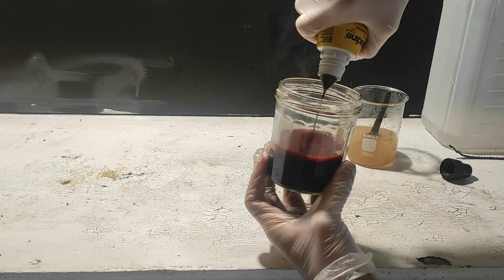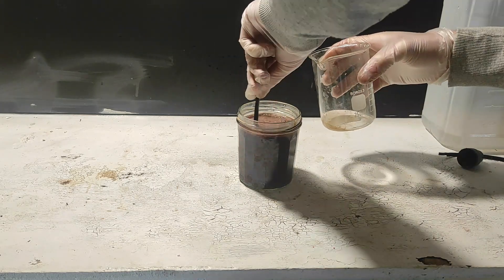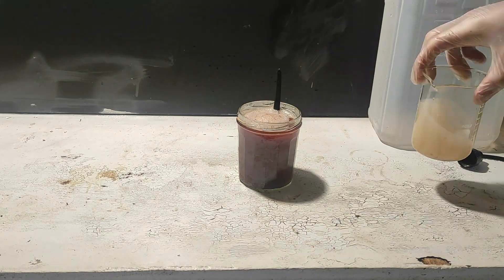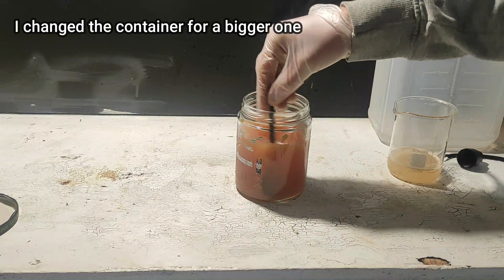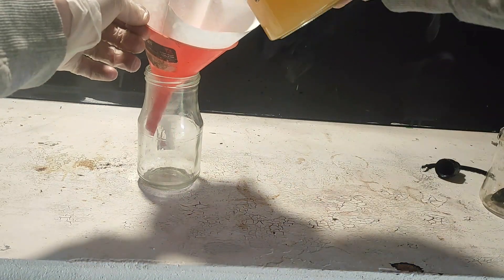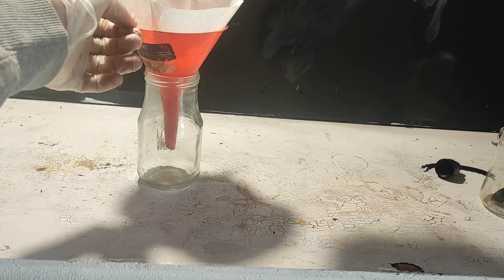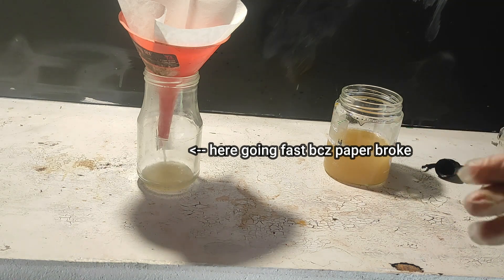Then we open the iodine bottle and empty it in a beaker. We add our solution while stirring vigorously, and the end point is reached when the solution takes a light yellow color — this means there is no more complex iodine. Now we let the solution cool to room temperature and then filter it. I first used a coffee filter, but the solution was too basic and dissolved the paper, so I changed it for a piece of cotton in the bottom of the funnel and that worked very well. The solution is now very clear compared to the old one.